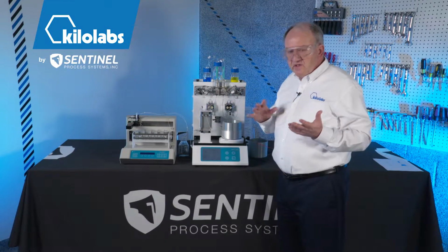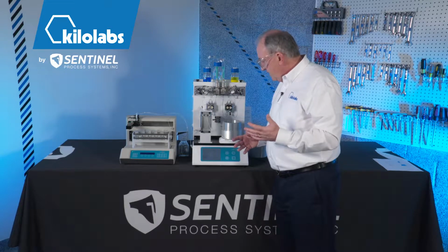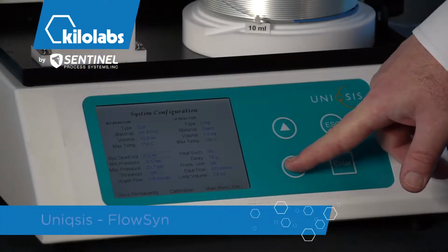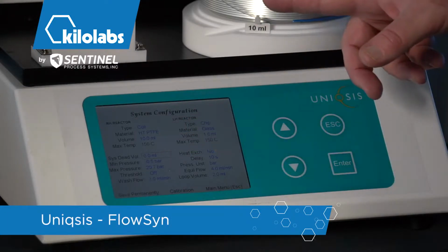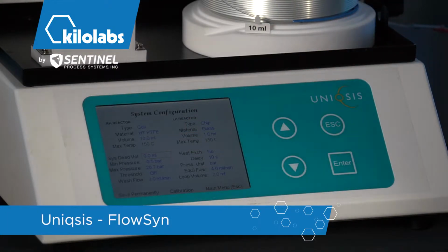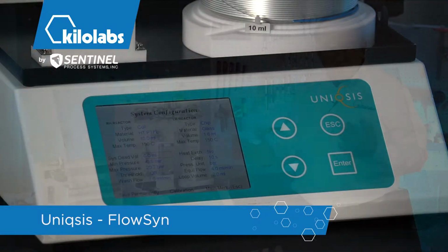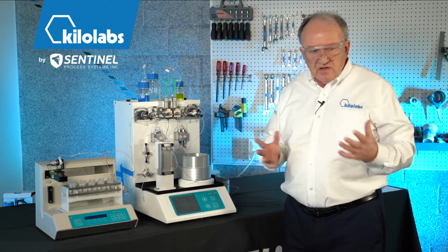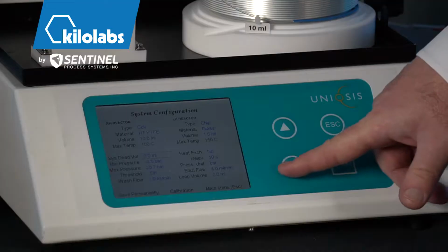But again, for the purpose of the demonstration, this is what we have set up for today. We have a coil and a mixing chip set up. And then we tell the system what the dead volume is, how much volume is left over or that we've introduced. The way this system comes configured is the dead volume parameter is set to 0 because the manufacturers know what the connection volumes already are.